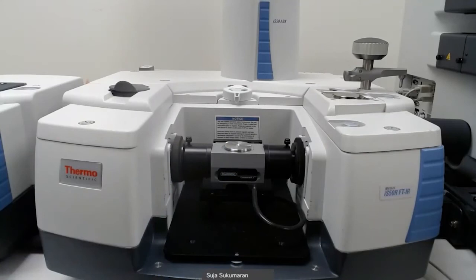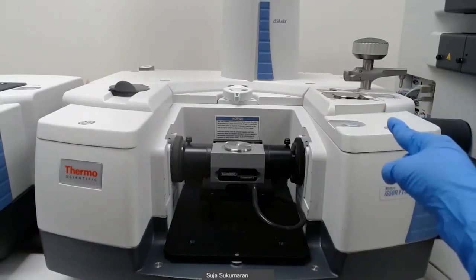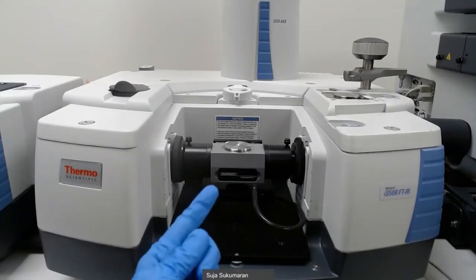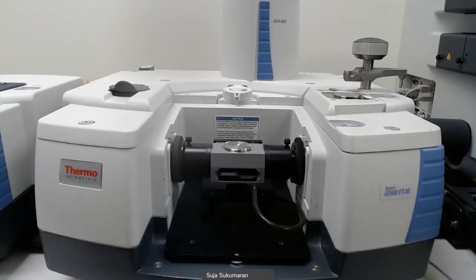There is a silicon version of it as well that can be used. I also have up on the right side a single bounce diamond ATR, which is great for powders. So we will run some protein liquids with our multi-bounce ATR, as well as some powders with our single bounce ATR.